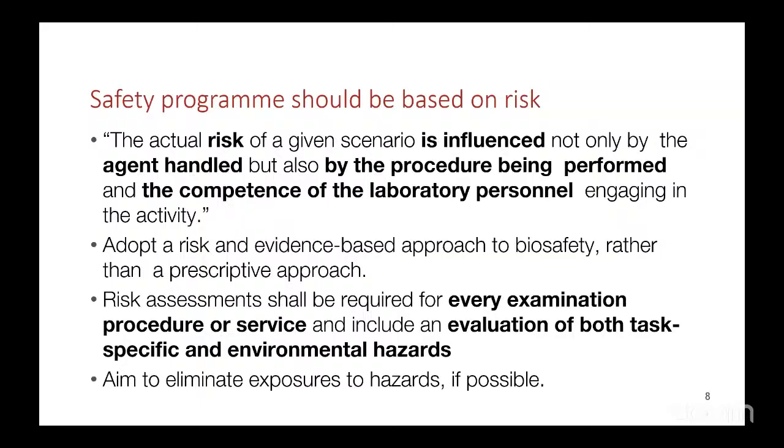In other words, risk management tells us that before something happens, we have to identify the potential risk, manage it, and ensure it does not happen. If something is going to happen, what is the risk of it happening? Is it going to be dangerous? Is it going to be severe? Is it going to be just light? Those things form risk assessment.